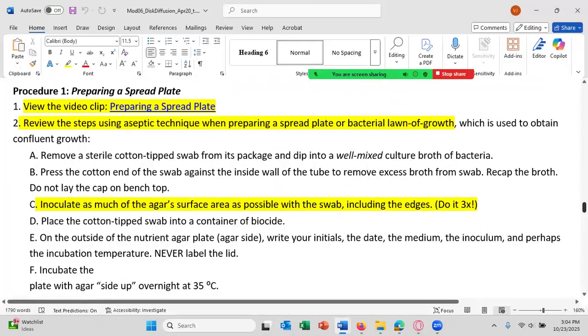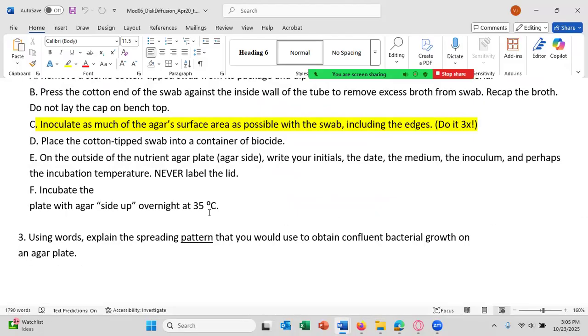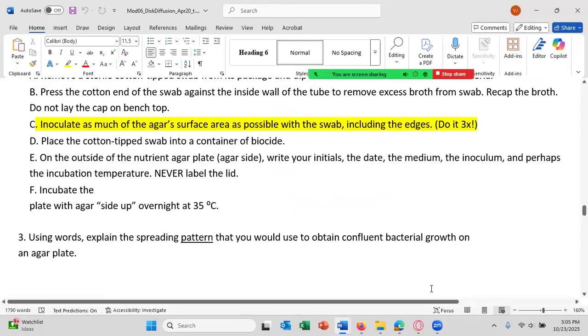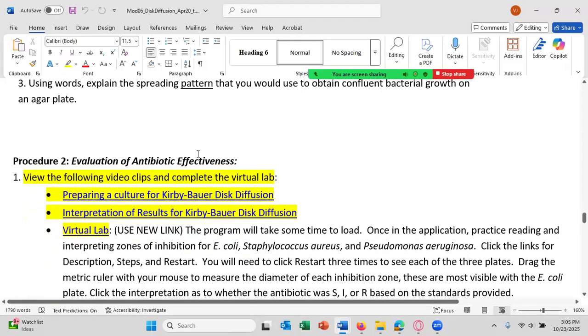We in the lab always did overnight because we couldn't really do 16 to 18 hours, so essentially you come back 24 or close to 24 hours later. So we didn't quite do that in the lab, but we attempted it. All right. And then let's go on to the worksheet here.